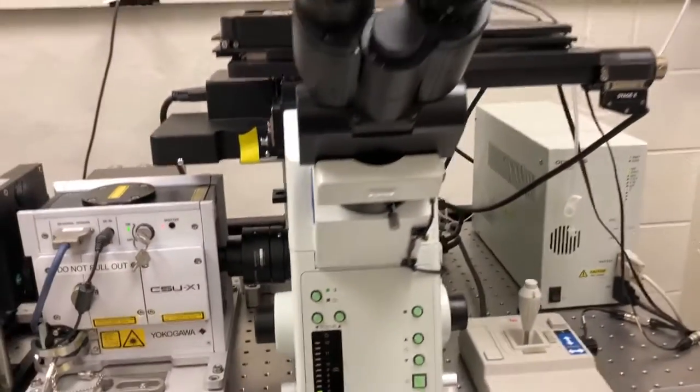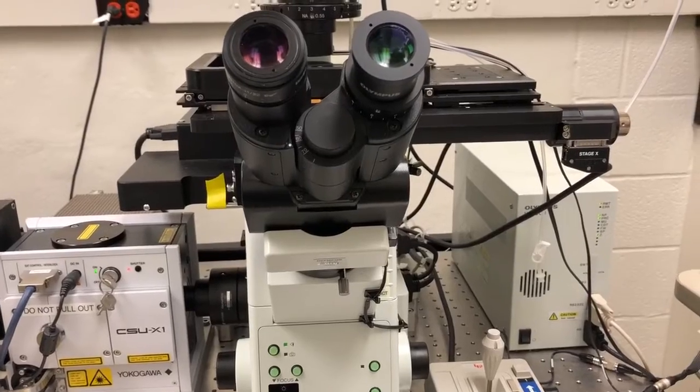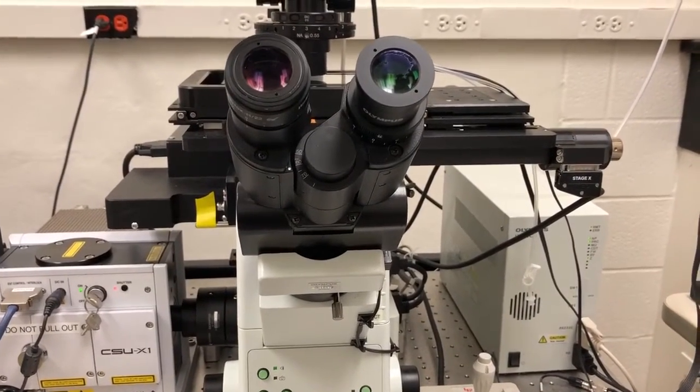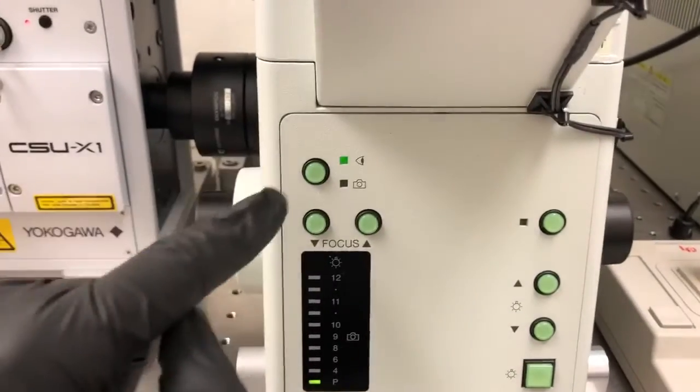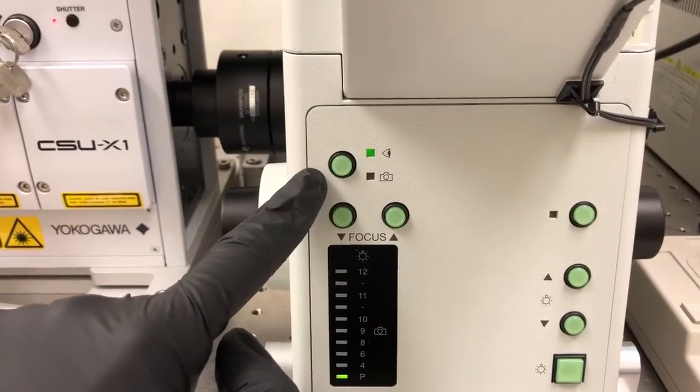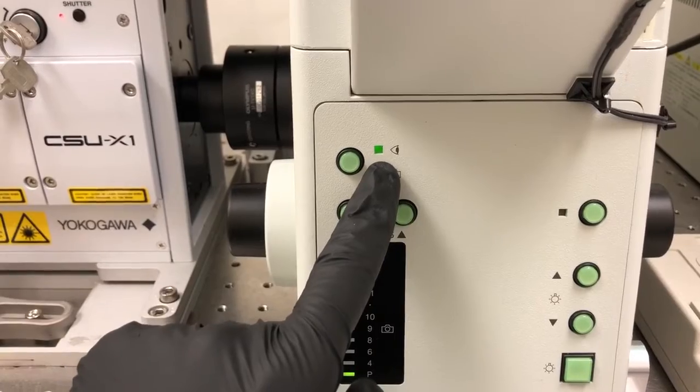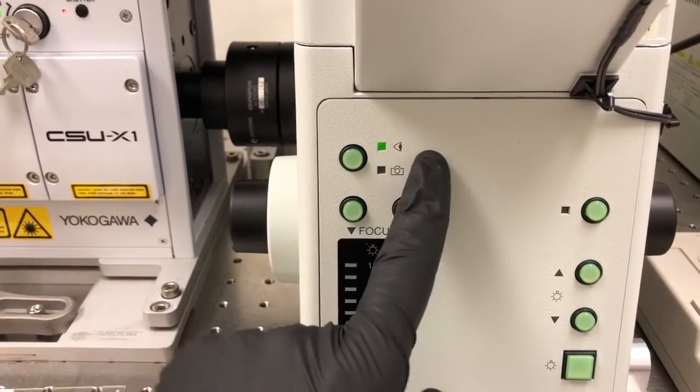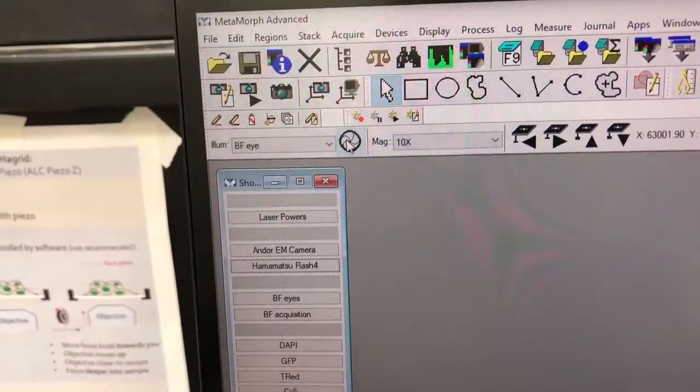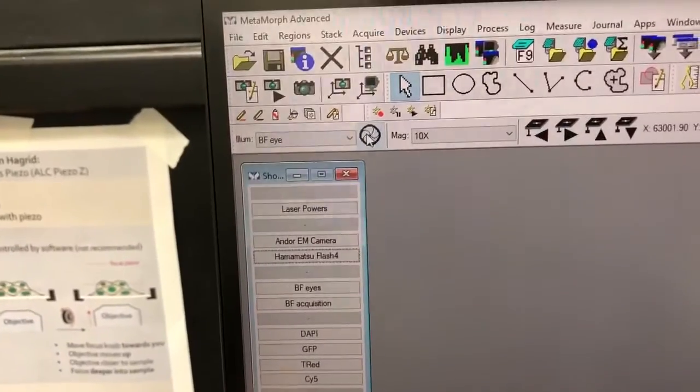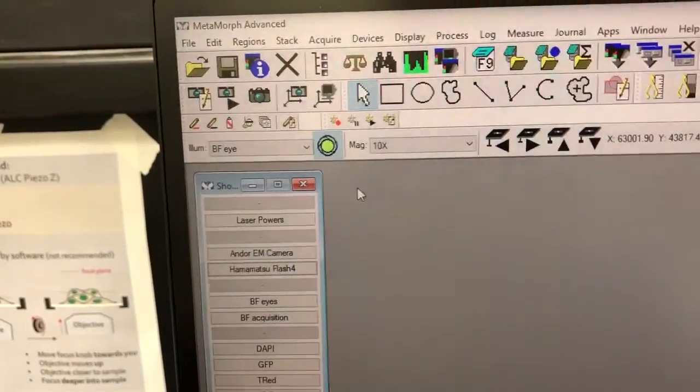The next things that we need to do are to ensure that the light goes to the eyepieces and that it can actually reach them. So to ensure that the light goes to the eyepieces, we have to take a look at these lights and make sure that the one next to the eye symbol is turned on. And so if we picked brightfield eye, that will automatically be set correctly. Let me actually turn this on again. I mistakenly turned it off.